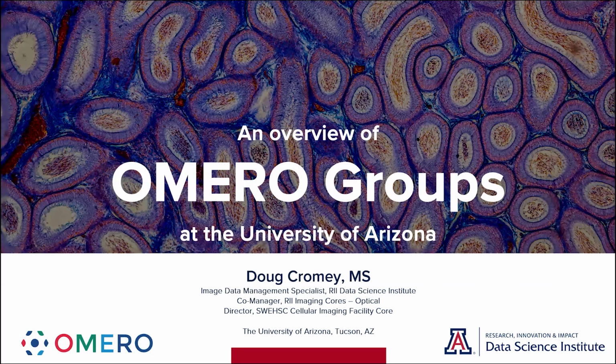Welcome. This video, the second in what we hope will be a three-part series, will be a quick introduction to groups for new users of OMERO at the University of Arizona.